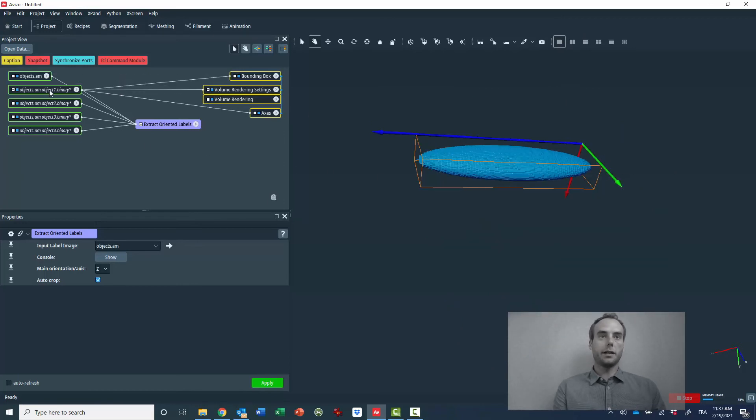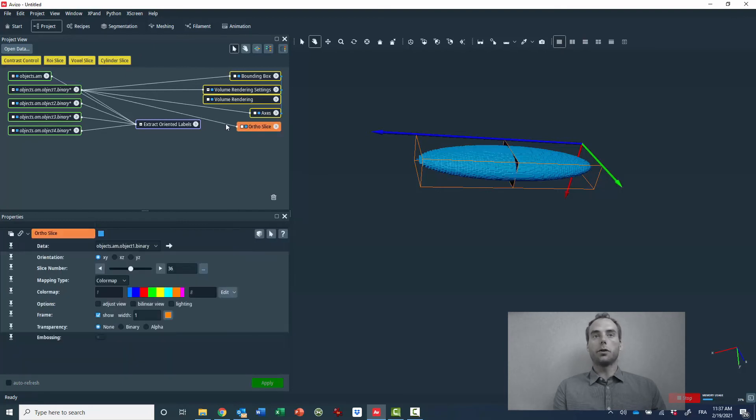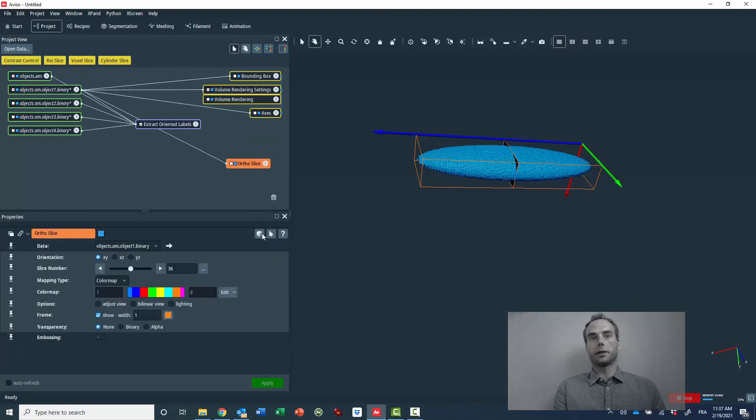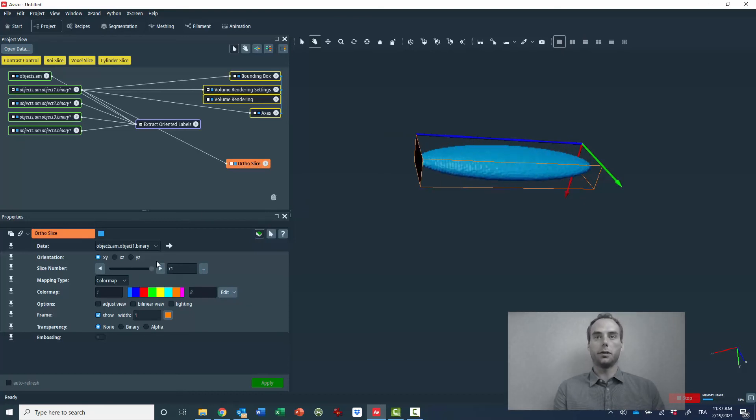So thanks to that, it's now really more convenient to slice through the object. Because now the slicing is performed along the three main orientation of the object.